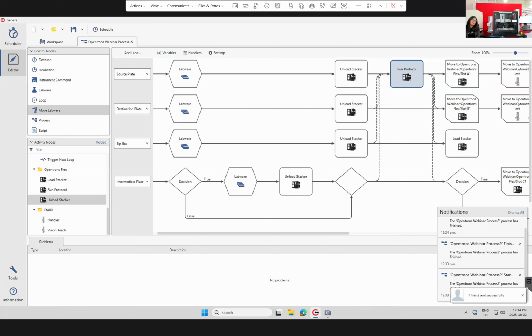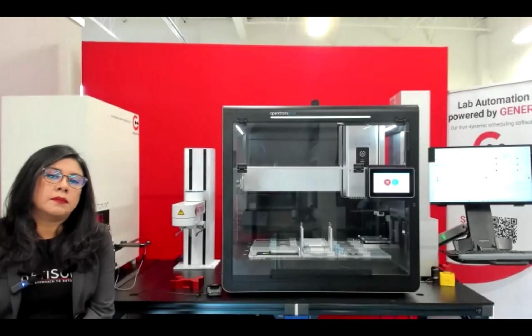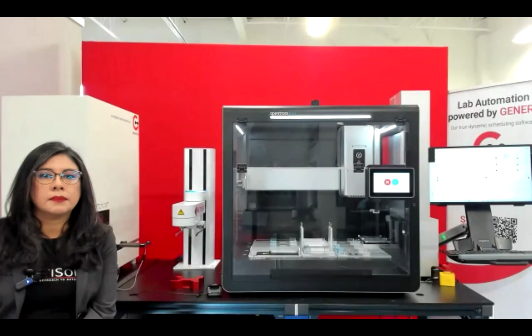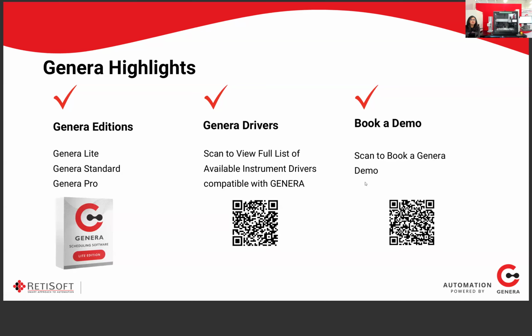So before we move on to Q&A, I'm going to share another screen. There we go. So I'm going to go through this quick presentation, going over a few things about Genera. So first of all, we have Genera editions. We have 3 editions: our Genera Lite, Genera Standard, and Genera Pro.